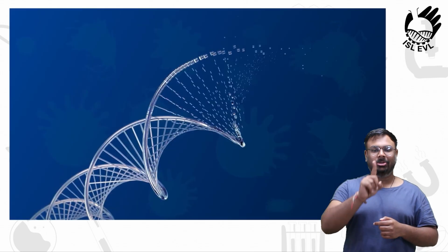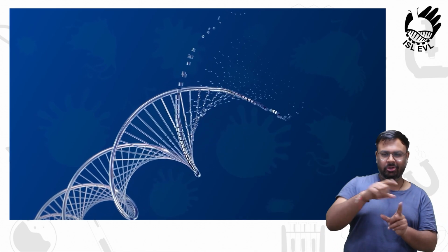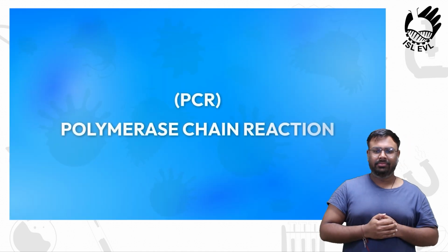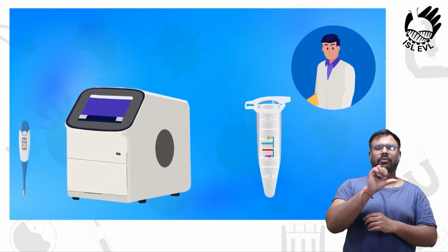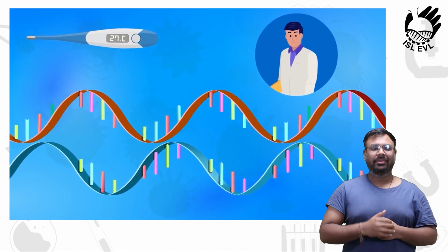For this, we first need to amplify its 16S-rRNA genes, which are conserved sequence in bacteria. In species of fungi and yeasts, we amplify the 18S-rRNA genes. This is done by a technique called PCR. We will first denature the DNA strands. This is done at 92 degrees Celsius, where the DNA strands start to unwind. Then comes the annealing stage at 54 degrees Celsius.